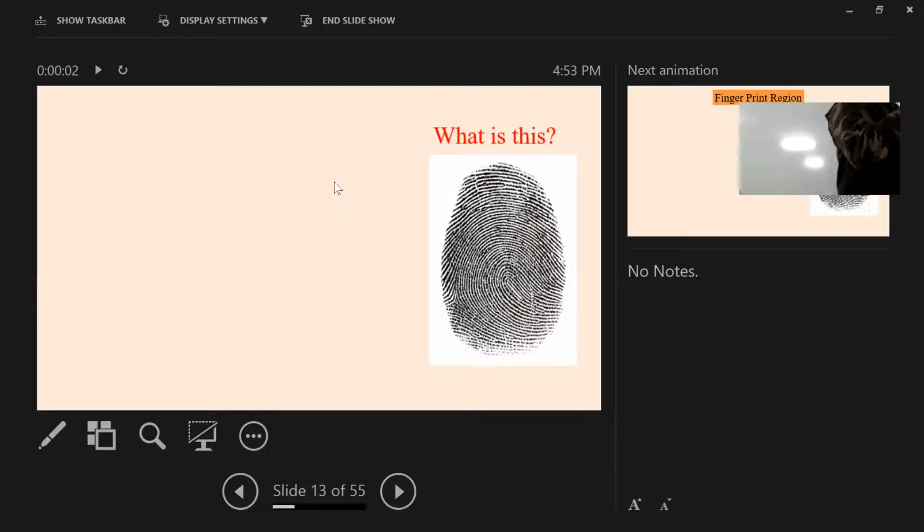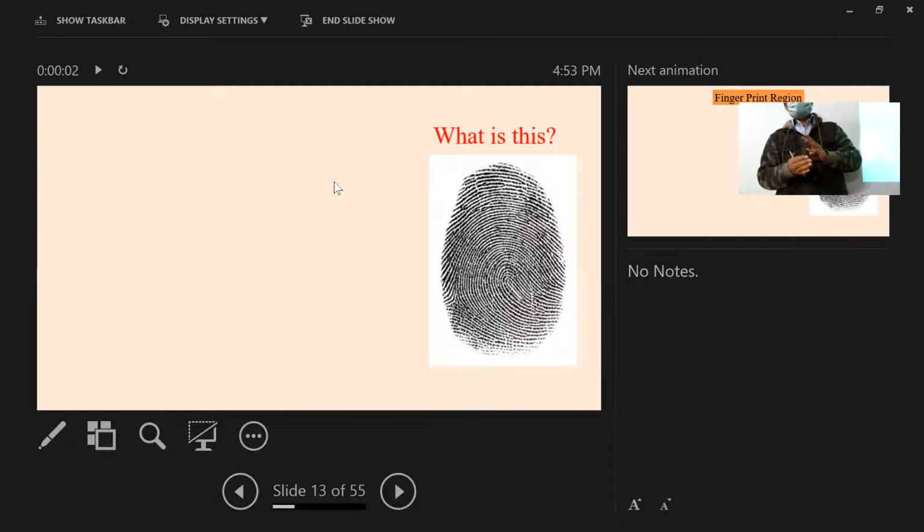Fingerprint means if you look exactly similar like this, maybe whatever for me, maybe like this, but not 100%. Because as we know, maybe you are coming from the same family, your father, your mother, your brother or sister or anyone from the same family, you may have the same DNA, same structure, same color. However, you have a different fingerprint.